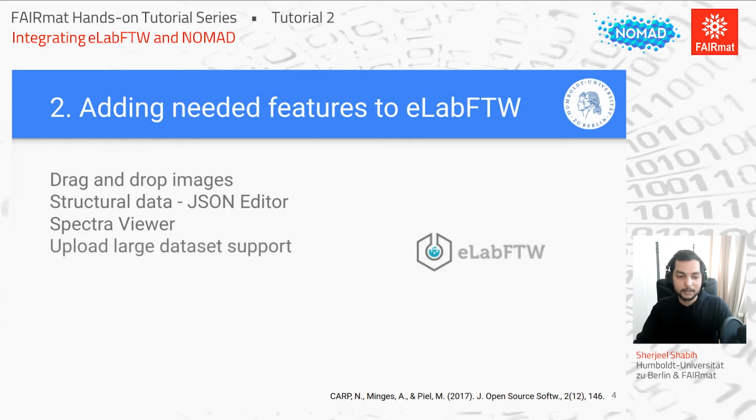On top of that, I know this question came up after Pepe's presentation, but this is something we had to actually add to eLabFTW. It supported files up to around 4 gigs or something, and it relies on the system RAM, and you really can't upload files that are bigger than what your RAM is on the installed system. There's also a timeout problem, like the bandwidth, the amount of time that it takes from your client PCs to send the data over. If it's really big, there's a time limitation and the connection cuts out. So these kinds of things had to be worked in. So we added support for that.